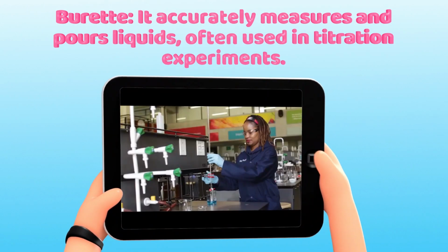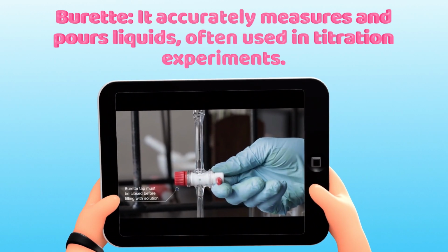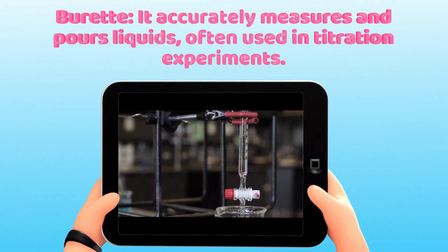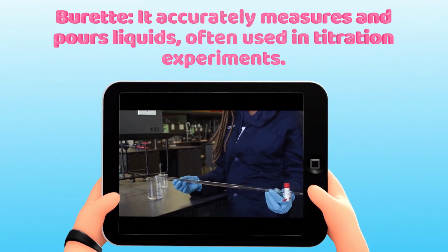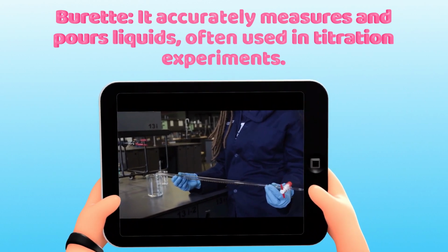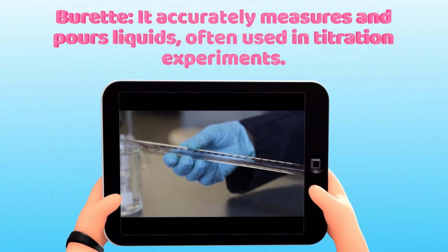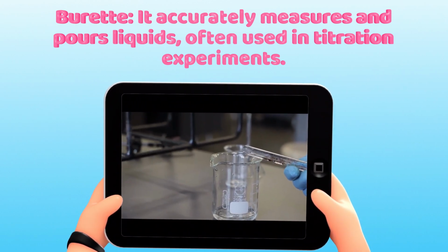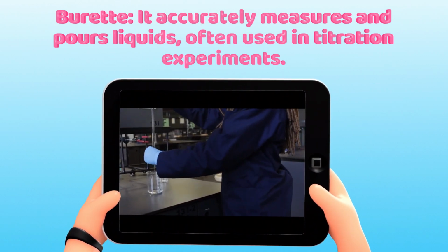Another apparatus is called the burette. This is usually used to accurately measure and pour liquid into vessels. It is often used for titration experiments, which you will do in your further studies of chemistry. As you can see from the screen, this is actually how a burette is used in a chemistry experiment. So keep on watching the screen so that you can get a feel of how burettes are practically used.